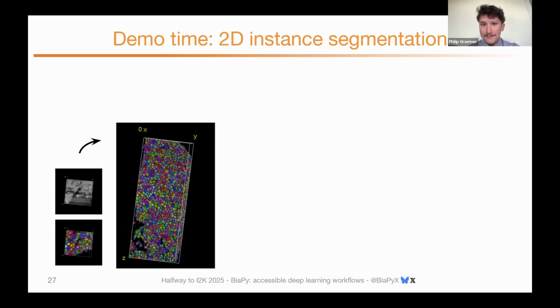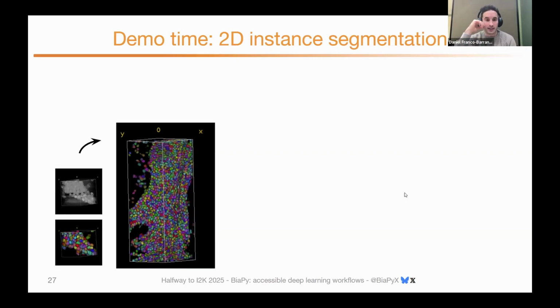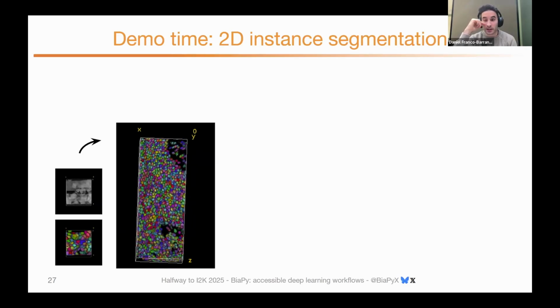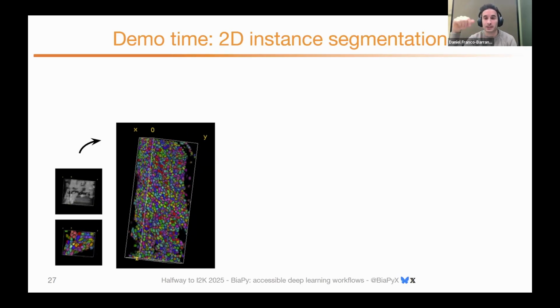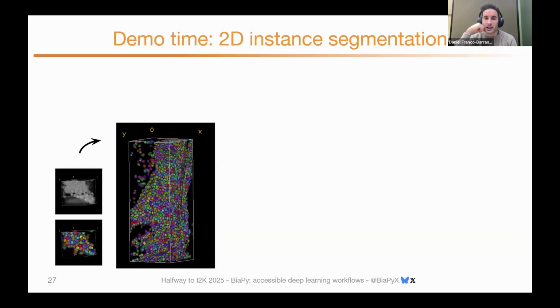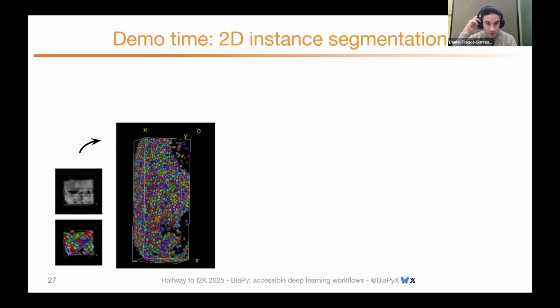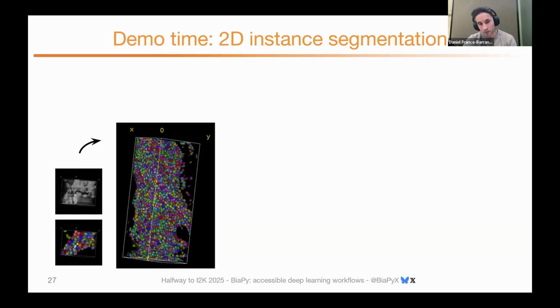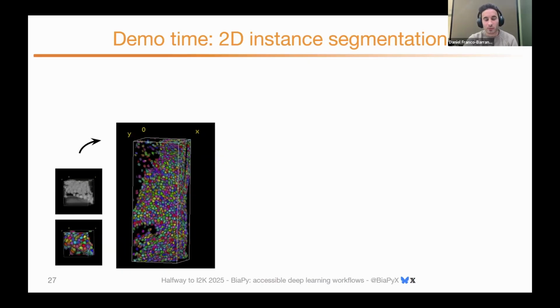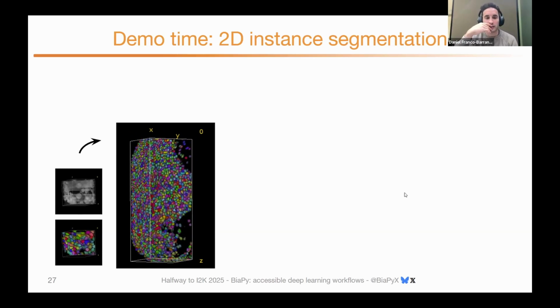And what we are also planning in self-supervised is to add a work that is SparK, to pre-train not only transformers but convolutional neural networks in the same way of masking. And also going back to the previous question, there are no plans to add Microsam or foundational models in that sense.